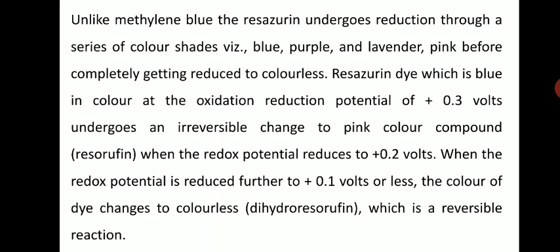So we'll see what is the basic principle behind this Resazurin reduction test. Unlike methylene blue, Resazurin undergoes reduction through a series of color changes, usually blue, purple and lavender, pink, before completely getting reduced to colorless.